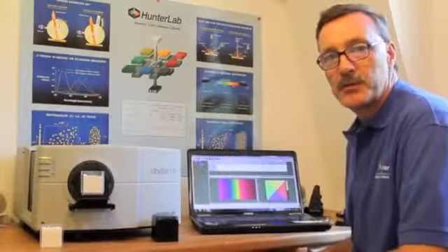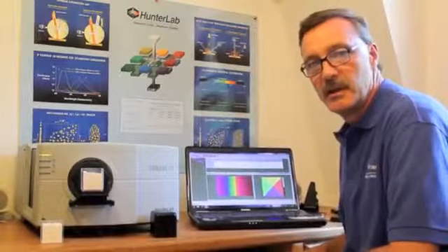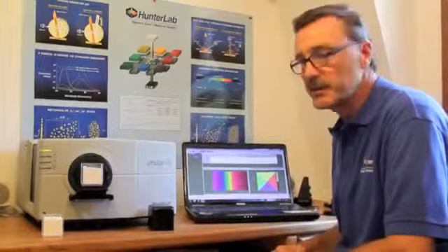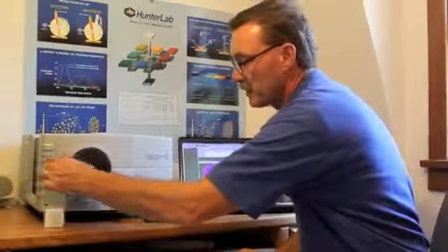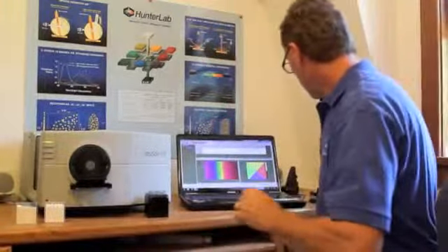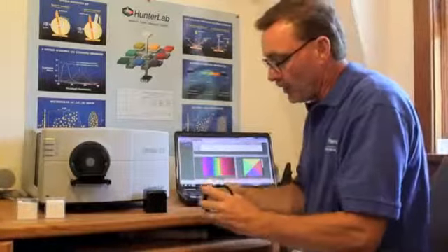HunterLab offers two versions of the Ultrascan. This is the UltrascanViz $17,000 system used to measure powders. We can also measure small volumes or small quantities of powder with a powder holder, where you may have less than one cc of powder used primarily in product development.